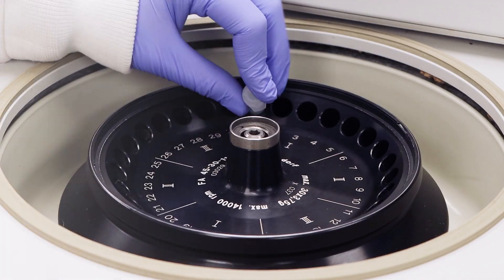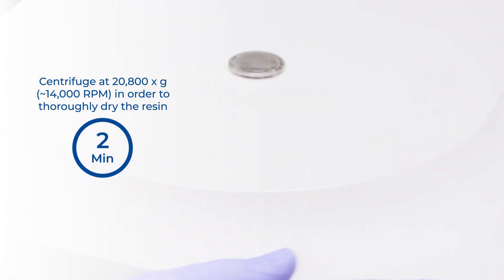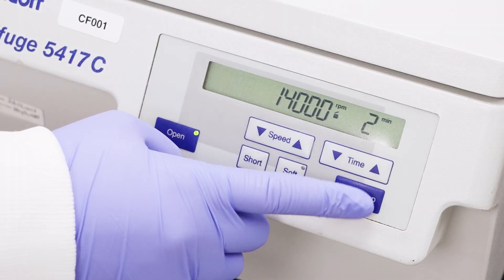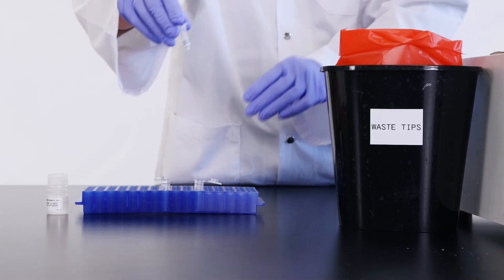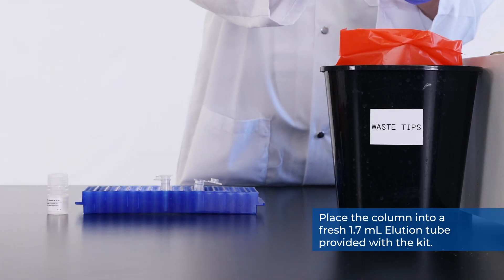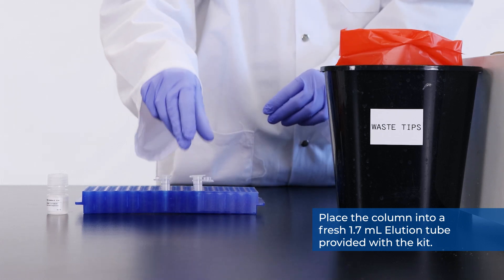For a total of 3 washes. Spin the column empty for 2 minutes in order to thoroughly dry the resin. Discard the collection tube. Place the column after being dried into a fresh 1.7 milliliter elution tube provided with the kit.